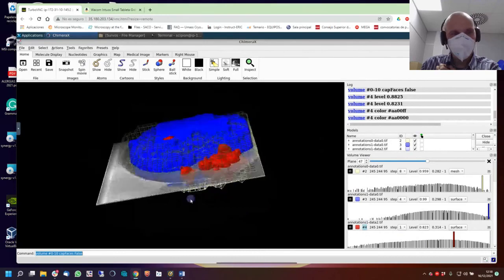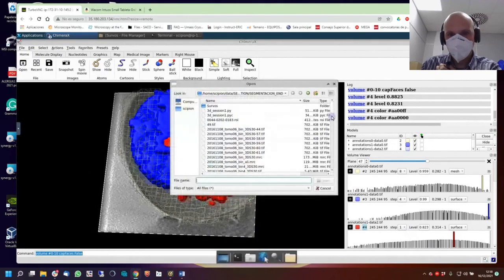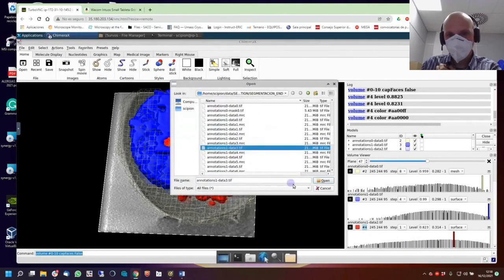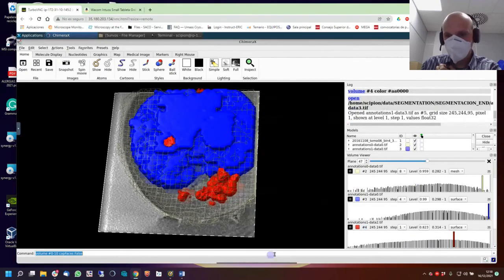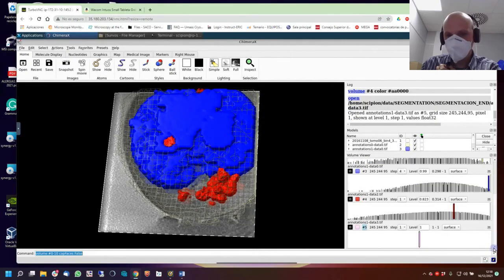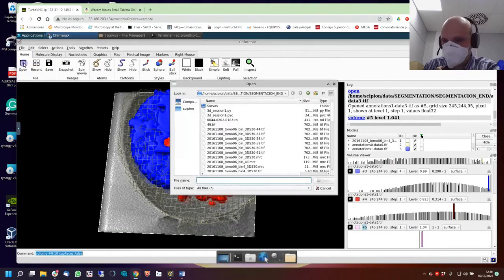Again, another one. Open. 2, 2, 2, 3 TIFFs. Yeah, it's open. What are those? Which volume is it? Oh, it should be just an empty one. Sometimes it happens because you wanted to keep the structure of the labels the same for everyone, so sometimes you get an empty volume. Open, doesn't matter. You see, there's only one line here.